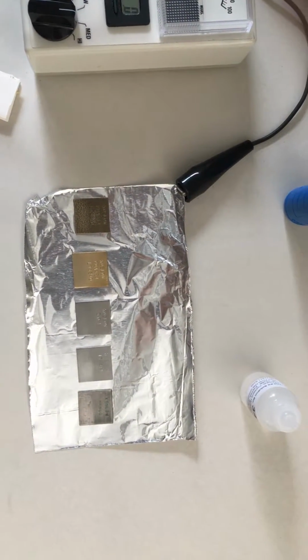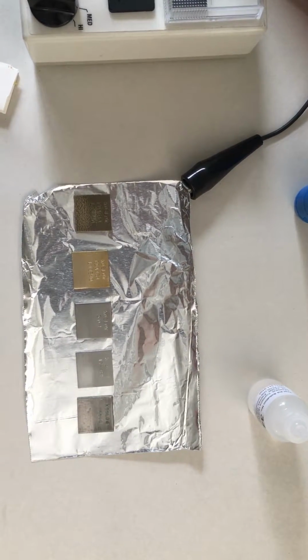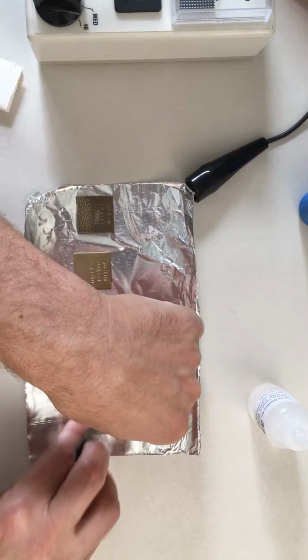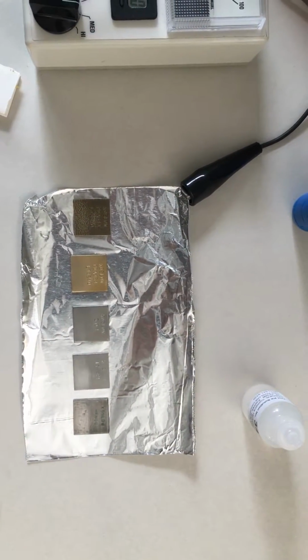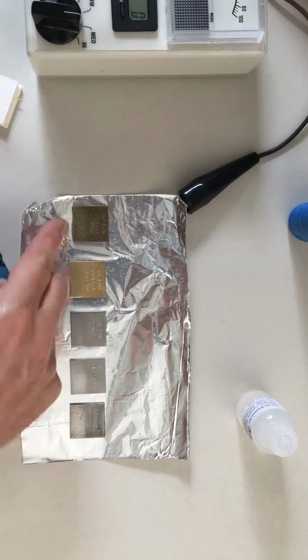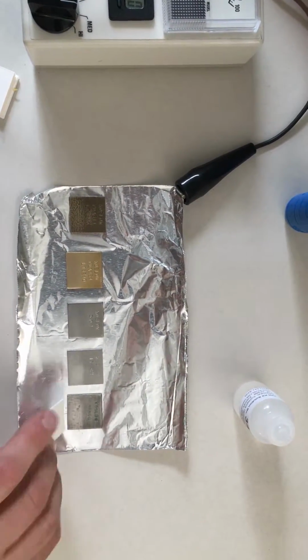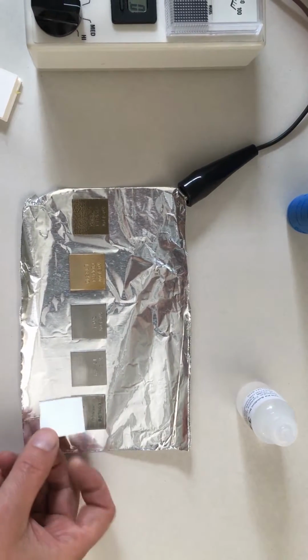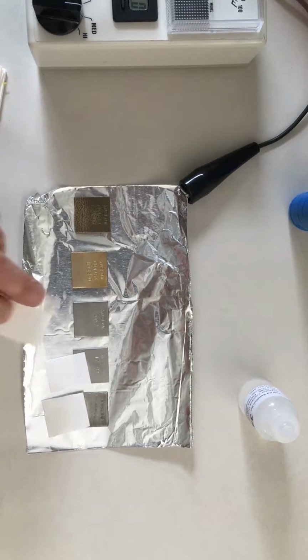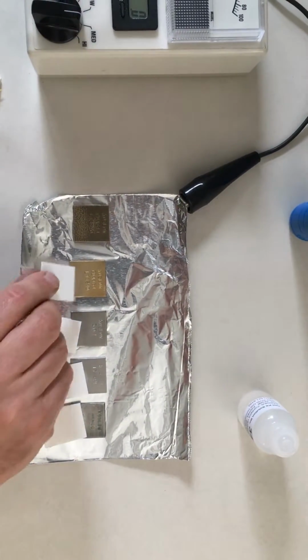All right, so today I'm demonstrating the aluminum and steels test kit. I think it's the Kozlo Detective Lab that has this test. It says to use a piece of emery paper and just shine up the metal, taking whatever residue off the surface so the test works out a little better. I'm going to do 5 different types of metal all at one time, because that's the way I roll.